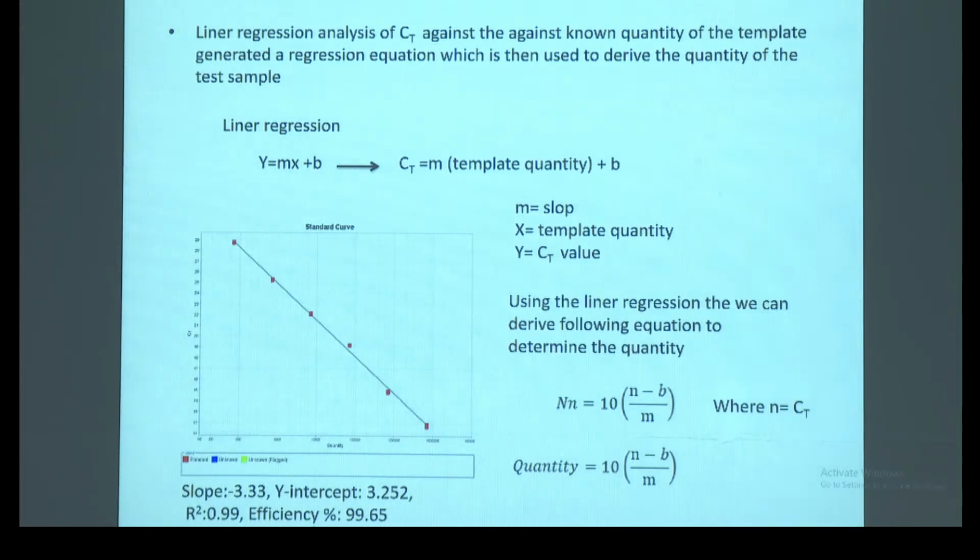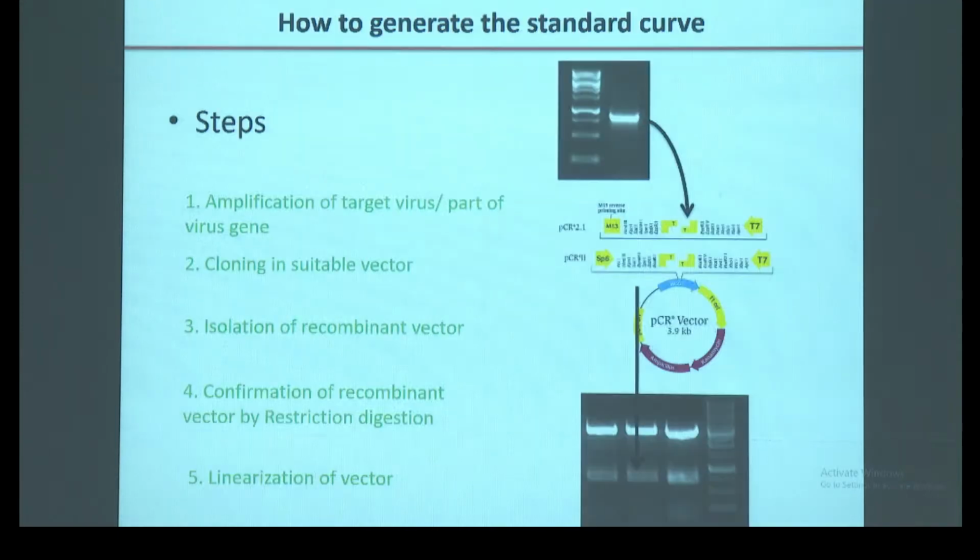We used to use StepOne Plus qPCR from Applied Biosystems, which has it. I don't know whether this Bio-Rad one has it or not. So we will see. If we are not getting it in the machine itself, then we will do it manually in Excel, right? If you have done HPLC or other spectrophotometric quantification, you might have already performed this, right?